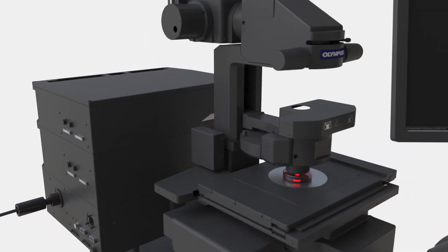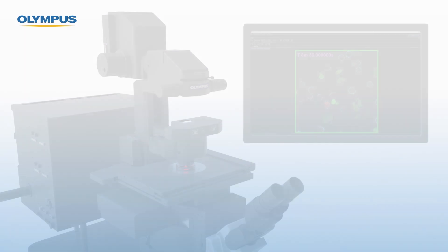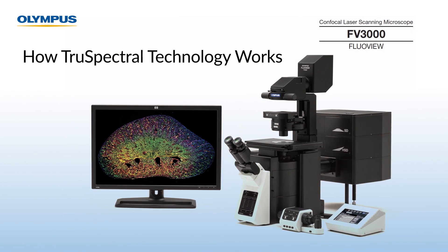TrueSpectral technology's efficient design enables the detectors to run in true multi-channel lambda mode for powerful yet gentle spectral imaging of both live and fixed tissue. The Olympus FV3000 microscope, the next generation FV for the next revolutions in science.